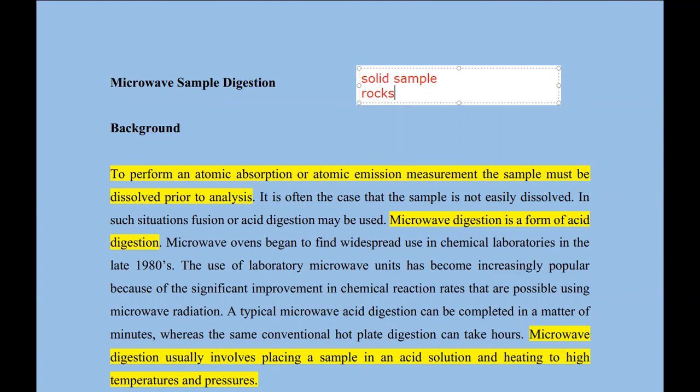So it's the duty of an analyst to go there to collect the sample. And you don't get the whole lot of the rock and say, I'm going to test everything in there. Of course, there are methods of sampling that we follow, depending on the physical state. Is it a gas, is it a solid, and stuff like that.